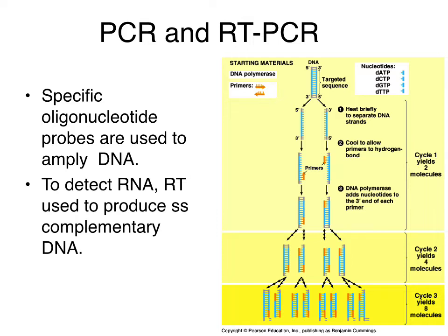The ingredients are placed in a tube and placed in the thermocycler. There are 3 major steps in a PCR, which are repeated for 30 to 40 cycles, and they include denaturation at 90 to 95 degrees centigrade to separate or melt the double-stranded DNA into single strands, annealing at temperature close to the melting temperature of the primers, and extension or polymerization, usually at 72 degrees centigrade, which is the ideal working temperature for the polymerase.